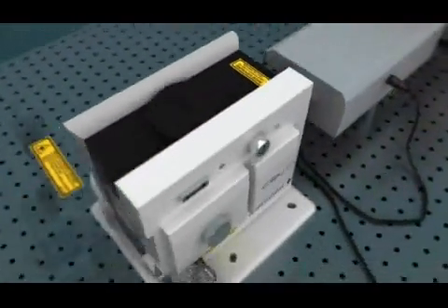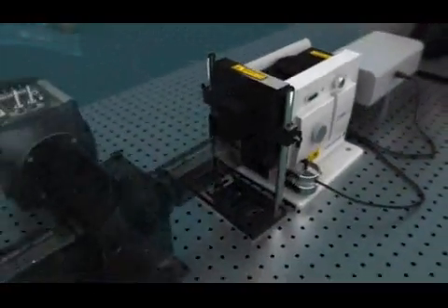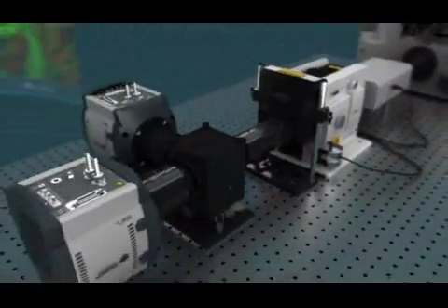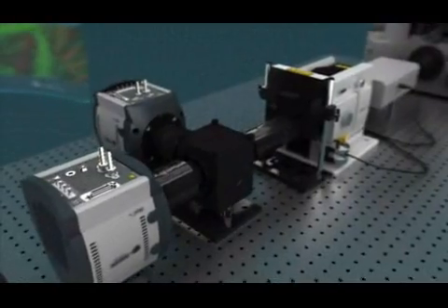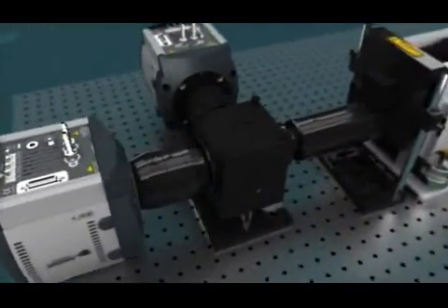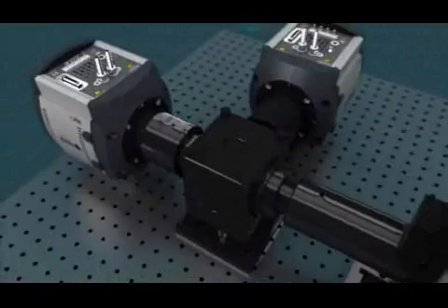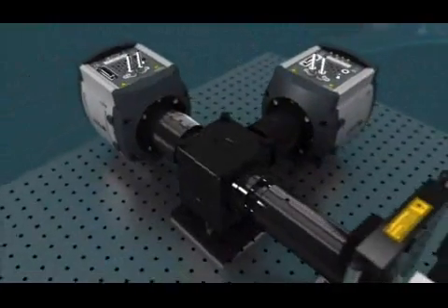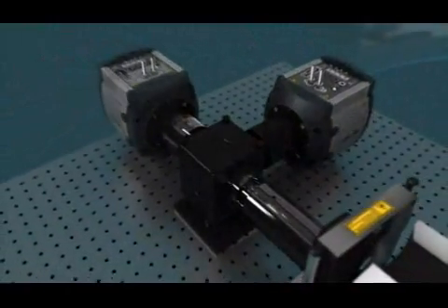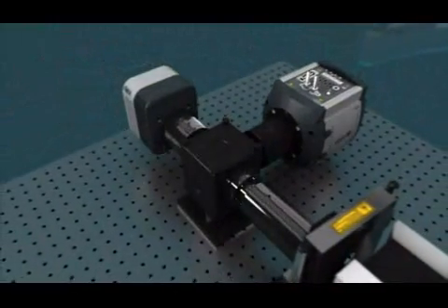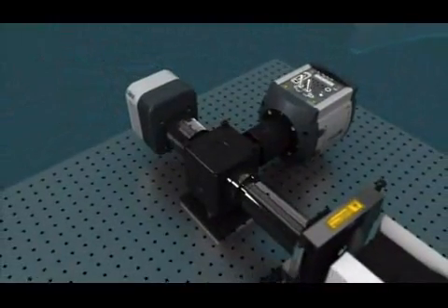Detection options include filter wheels, field splitters and dual camera adapters to support multi-channel parametric imaging. There are no better detectors for live cell imaging than Andor Ixon or Clara.